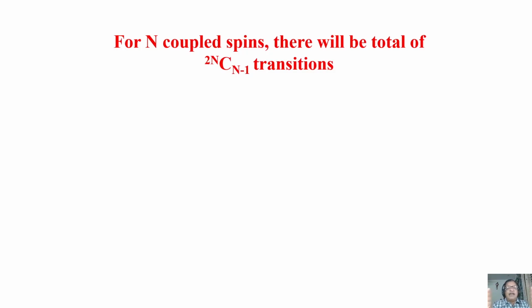We calculated even what are the eigenvalues of each of these spin states, found out the frequency separations, and we got each spin is split into a doublet, whose frequency separation corresponds to the coupling between them called JAX, and the center of each doublet gives you the corresponding chemical shift of the two protons. And also I said in the weakly coupled case, the intensity ratio is 1:1:1:1, all the four peaks of this AX spin system. This is an important point which you must remember when you want to analyze two weakly coupled spin systems.